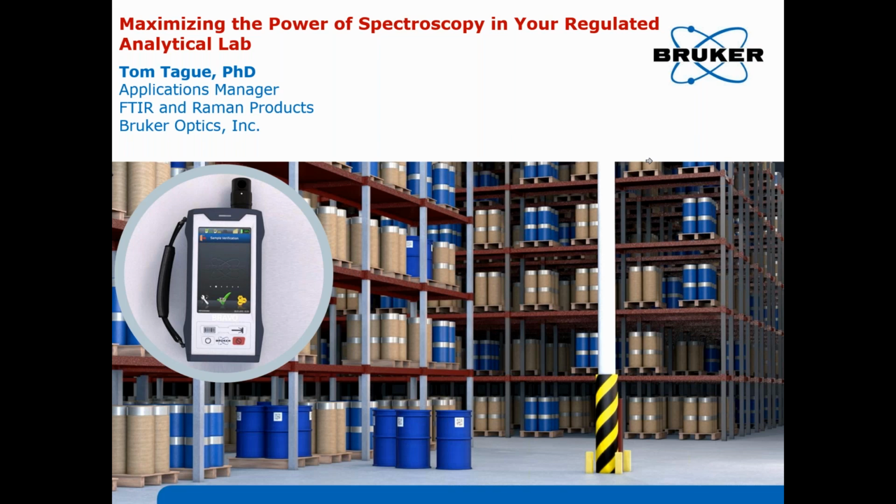Great, thank you, Lauren. I'm excited to talk with you today about maximizing the power of spectroscopy in your regulated analytical lab. This is a little different than some talks because we're actually going to talk about infrared and Raman spectroscopy and microspectroscopies and how they can help you within the confines of even the most demanding regulatory regulations. And as we do that, we'll see some beautiful examples from the polymer industry, the pharmaceutical industry, and some of the applications that are most interesting that we see have the greatest impact, such as reverse engineering, or trying to identify those annoying contaminants that don't belong there.